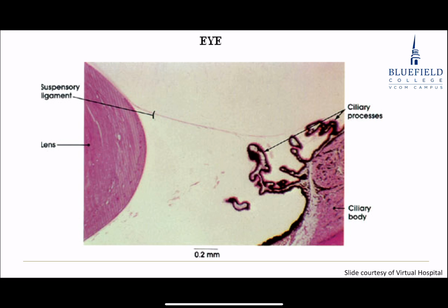All right, this is the slide. When you see this one, you take a picture because you can sell it. Okay? Here's the ciliary body over here, lens over here, ciliary processes. I've never seen a slide that comes all the way. I showed the ligament of Zinn going all the way connected. Okay? You normally just see bits and pieces. That's what you're seeing right in here, these little bits and pieces of ligaments of Zinn. Here you caught one going the entire distance, the entire length there.